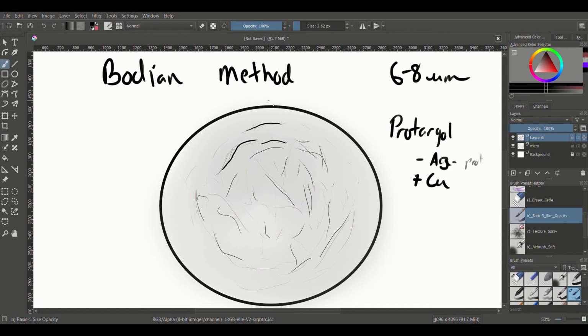And after the gold chloride, we will continue to develop in an oxalic acid. We just want you to do that until the contrast is really good. That should get rid of some of the gray in the background. There's still going to be some, but you just keep doing that until you're seeing really good development of the nerves and maybe a little bit less background staining. What we're looking for is just nerve fibers at this point.